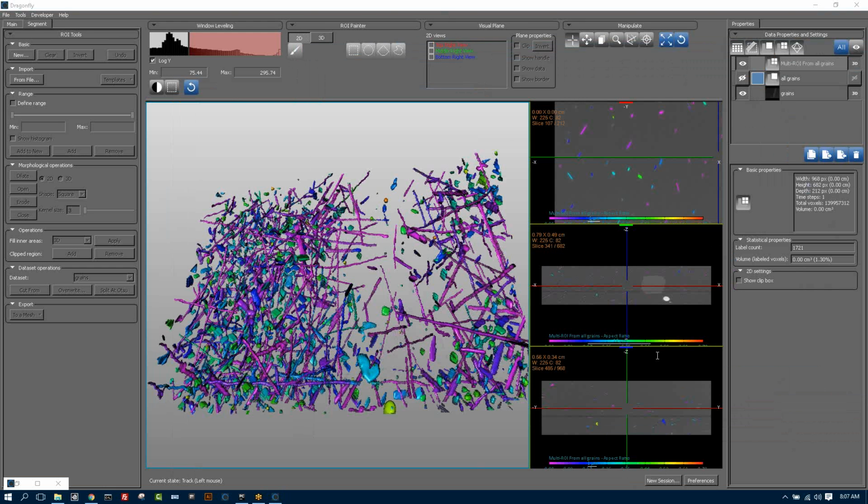So you may want to do some filtering, or you may want to do some analysis of the gray level. You can do histograms of different areas of the image to see if that is an issue. But I would love to talk about this more offline, and we could talk more about the application area and the imaging modality and how that might introduce uncertainties. But I don't have any specific answers at this point. Other questions?